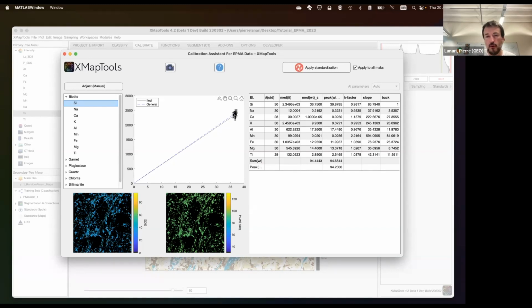So what is very important is to see that here we reproduce all the spot analysis that go through this calibration curve. And usually the total is quite a good indication that the program is doing a good job because you can have substitutions in your minerals. So you can have, for example, a bit lower iron and a higher magnesium, but at the end, the total would be okay. So here you can simply go and display the different calibration curves.